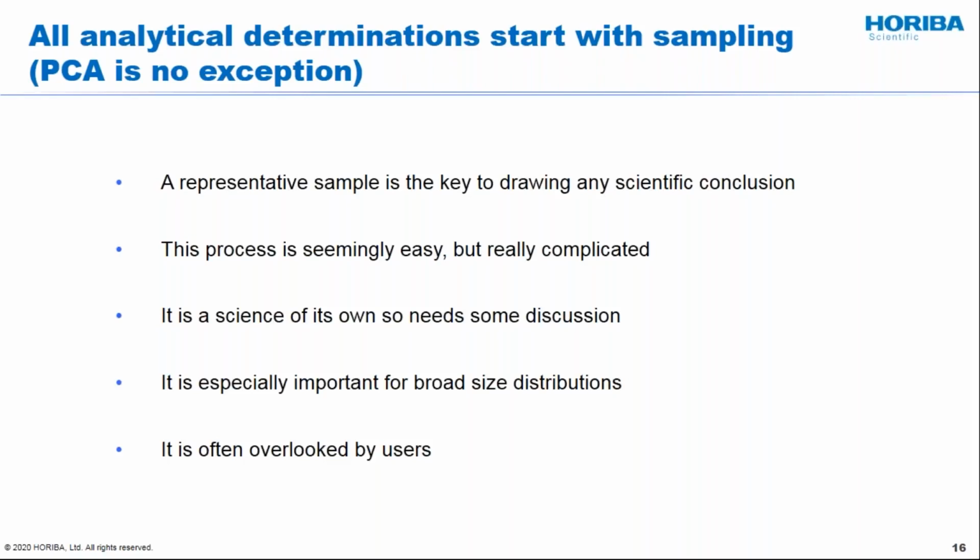You'll see from the subsequent slides that this is almost a science in and of itself. There's textbooks written on it. There's different ways of doing things. Bear in mind, this is going to be very, very important, especially if you have a broad distribution of particle sizes. The broad sizes very, very definitely segregate, and the temptation would certainly be, here's my beaker, let's just scoop it off the top. But as you'll find out, that can be very, very dangerous. And when we look at people who are having problems with particle size, very, very often this is the place where they got tripped up.